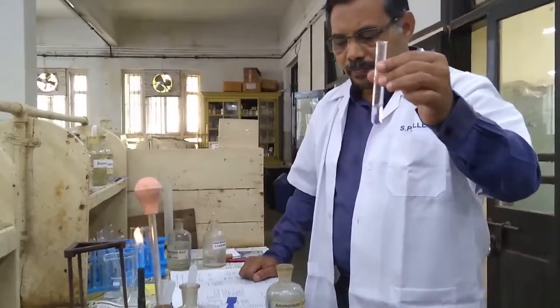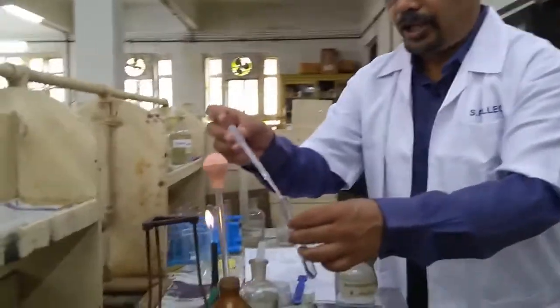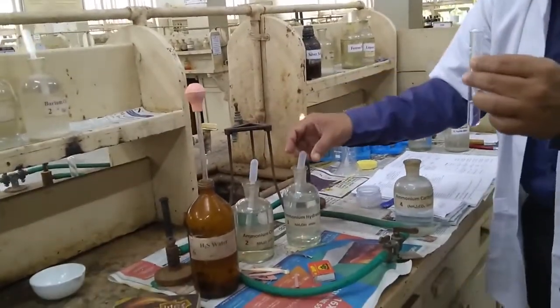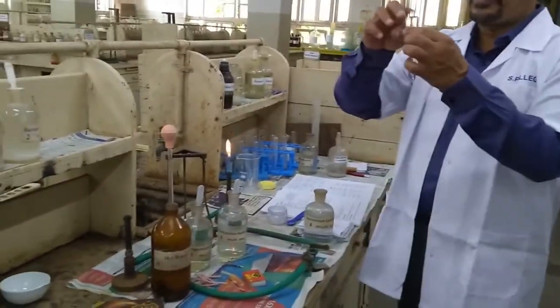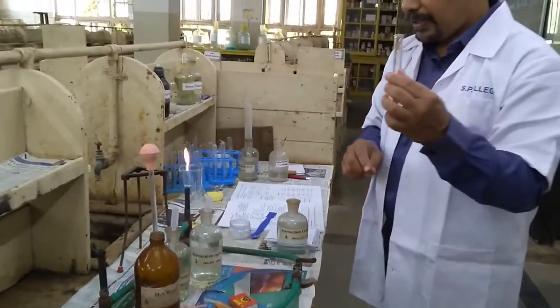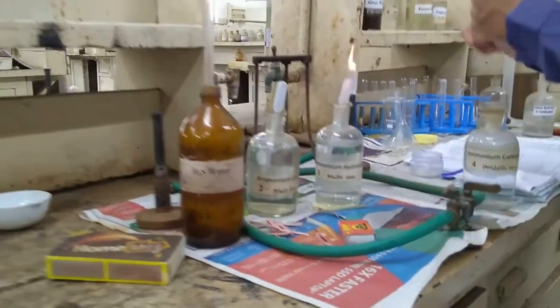So this is the original solution. I will take a small quantity of NH4Cl. Then I will put one red litmus paper piece in this solution. So the red litmus paper piece is added. Then I will add a small quantity of ammonium hydroxide drop by drop.